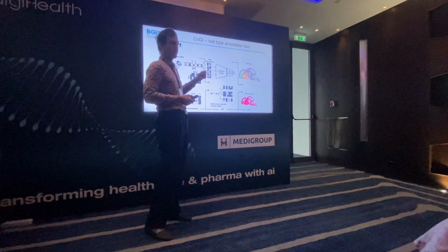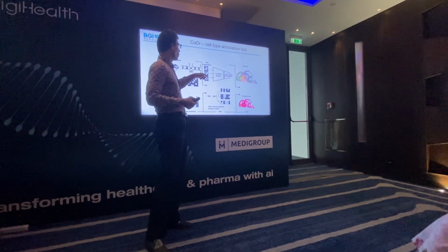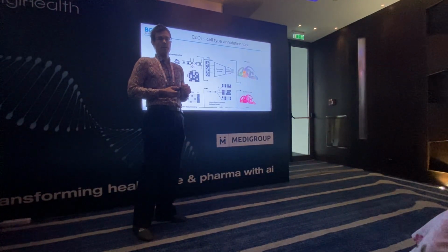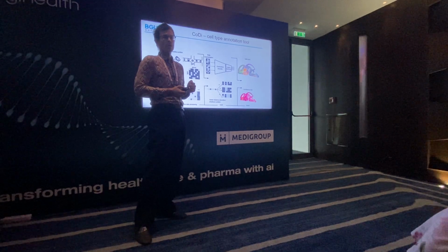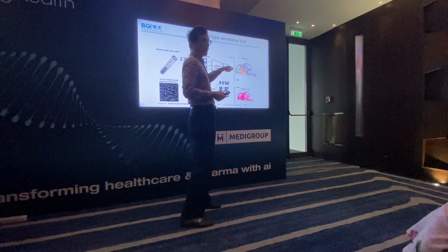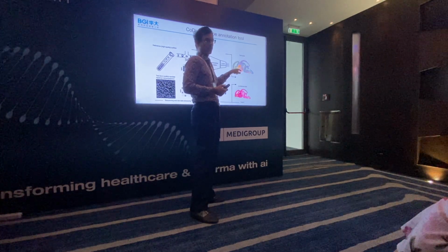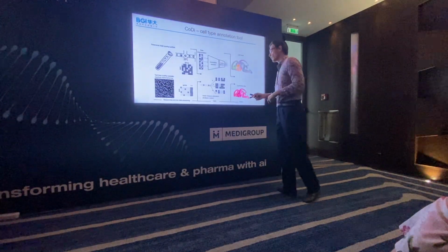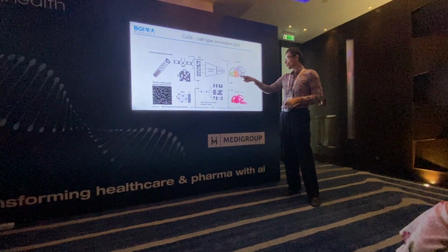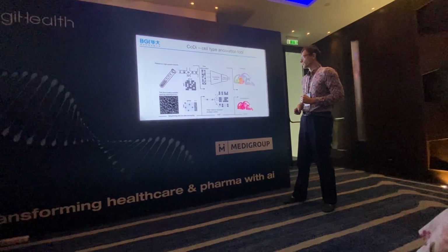And in parallel, we train a deep learning encoder in order to predict cell types. We train the deep learning encoder with the single cell reference data, which already has annotations, and perform prediction on the spatial transcriptomics dataset. As a final result, we obtain cell types for every individual cell, together with a confidence map, telling us how reliably our tool predicted the cell type of each individual cell.